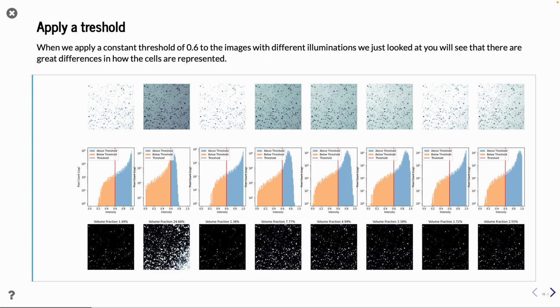And it was actually very dark. And then you can see the other ones, they are fluctuating between 1.5 and 7-8%. Looks more natural, but you have to be aware that probably you need to set the threshold individually per image, so you can't rely on the fact that you can use the same threshold.